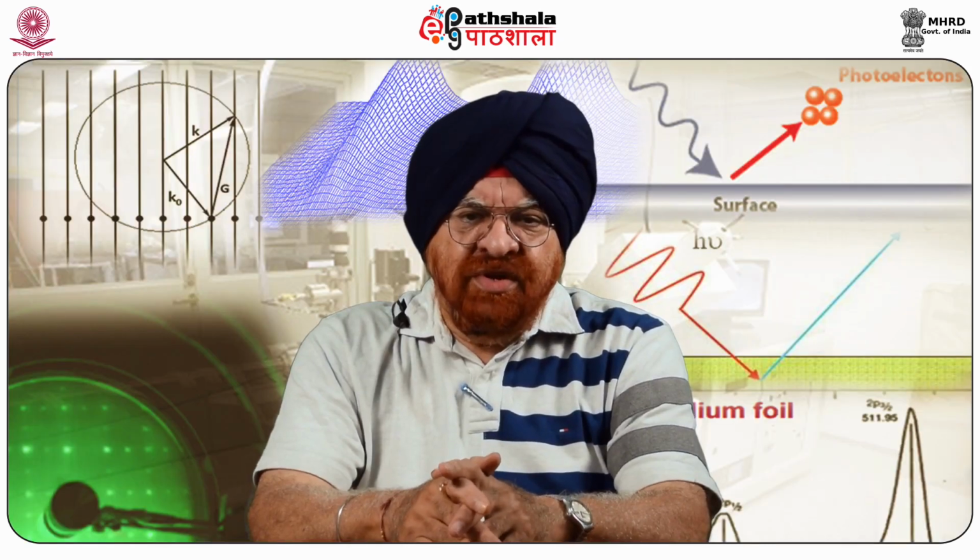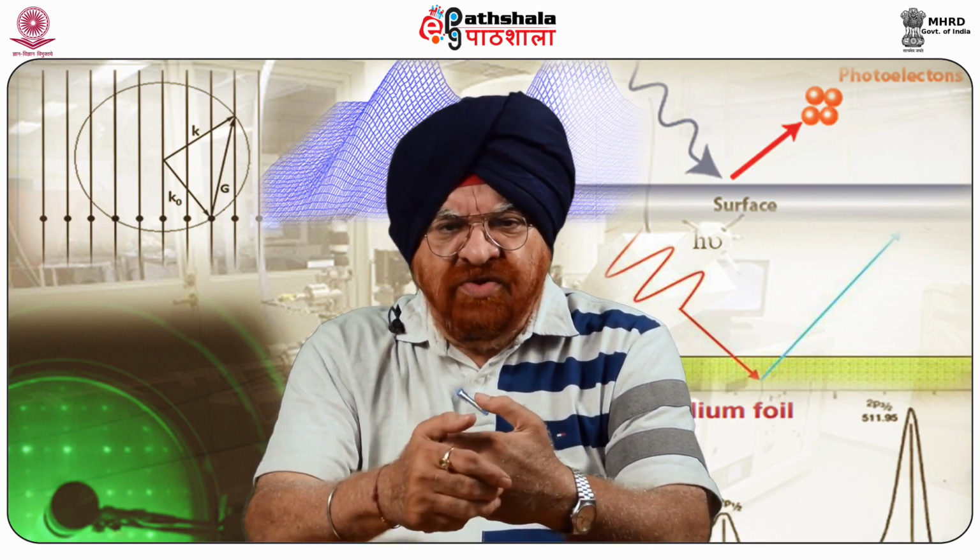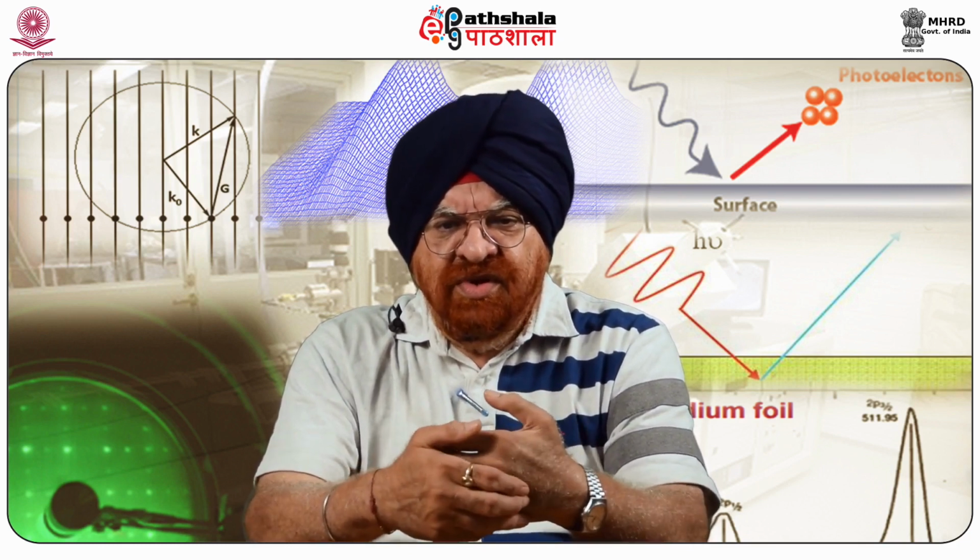Well, one should mention at this point that for non-perfect surfaces, that is, which are not very smooth, they are irregular, they are rough, G is not in any case a well-defined quantum number. Then what has to be considered when using the second relation is what we deal with in this particular spectroscopy. Variables subscripted with I denote values of incident electrons, and those subscripted with S denote values of scattered electrons, and parallel to the surface is denoted with the sign of two parallel lines.